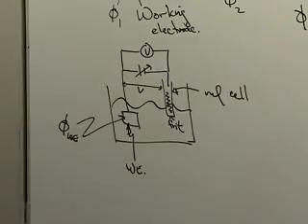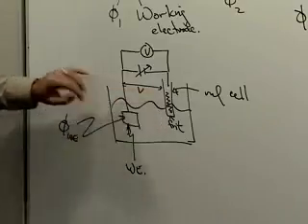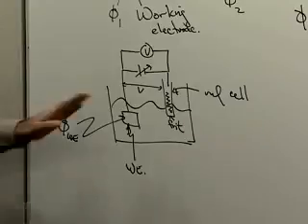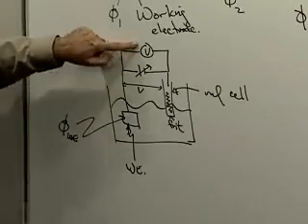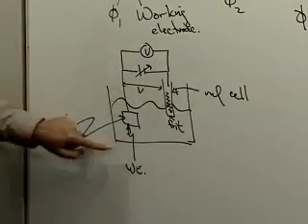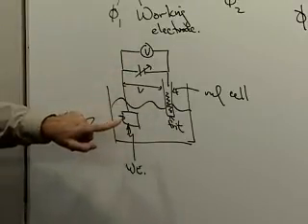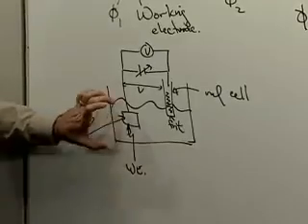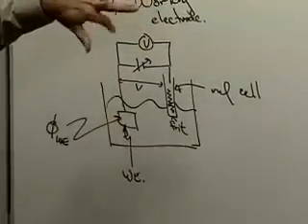Now, the first thing you're going to find out is that although you go and set some voltage here and everything looks fine, after a few minutes, the voltage that you read up here is different than the original voltage that you've set. And why is that? Well, again, the interface here is undergoing a redox reaction, and so the Nernst equation tells us that potential is changing, and so the voltage drop across these two things is changing.